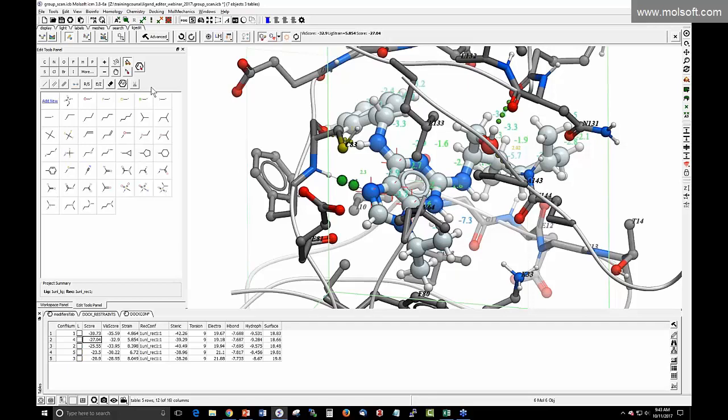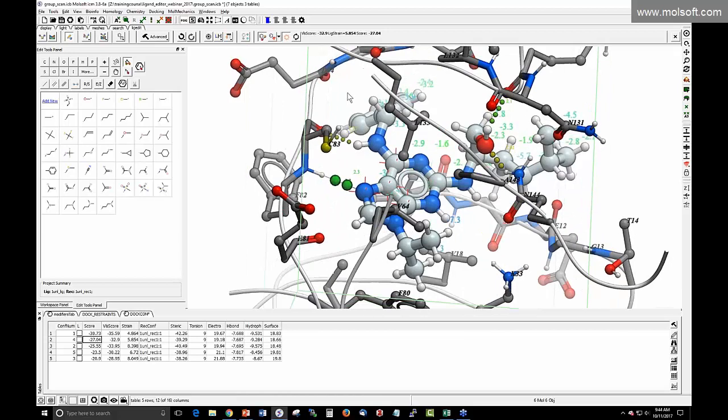Okay, so if you had multiple receptors, if you go back to the video from a couple of weeks ago, you can click and hold and it will dock to a stack of receptors as well. Flexibility. And once you've docked, you can also refine the side chains. There's the option to have side chains being fully flexible during docking, if you carefully select 3 or 4 of them. But you can also just refine the side chains by clicking on Advanced and going here.